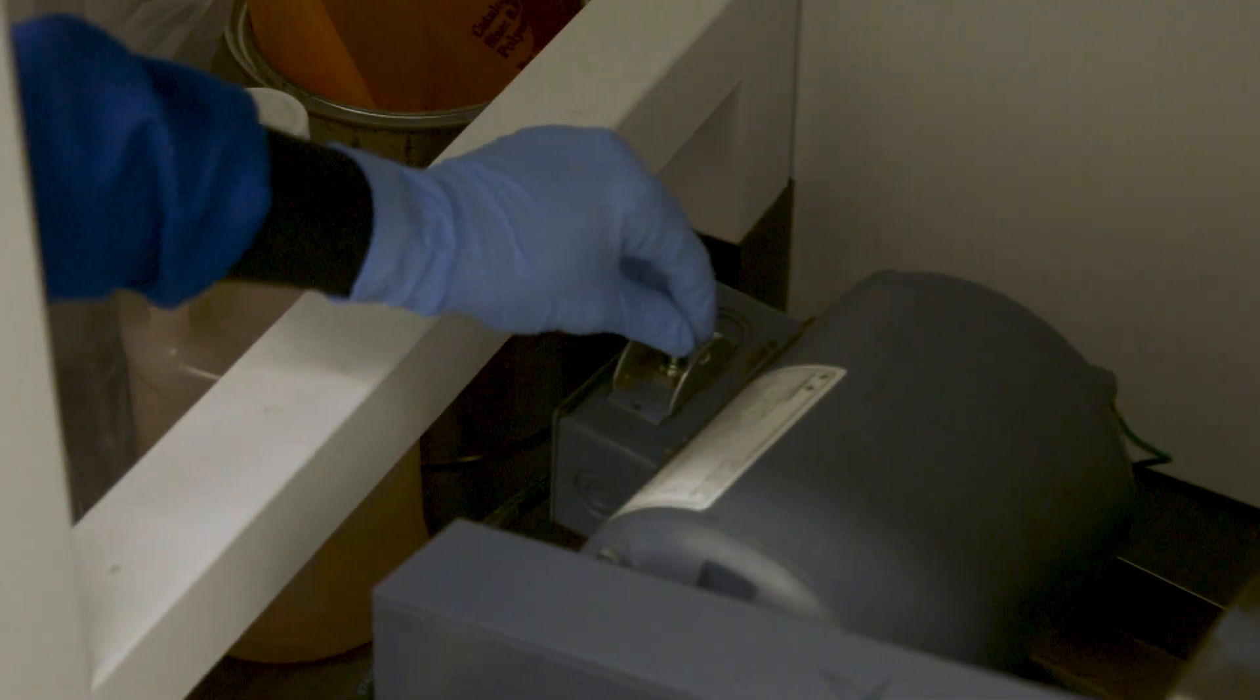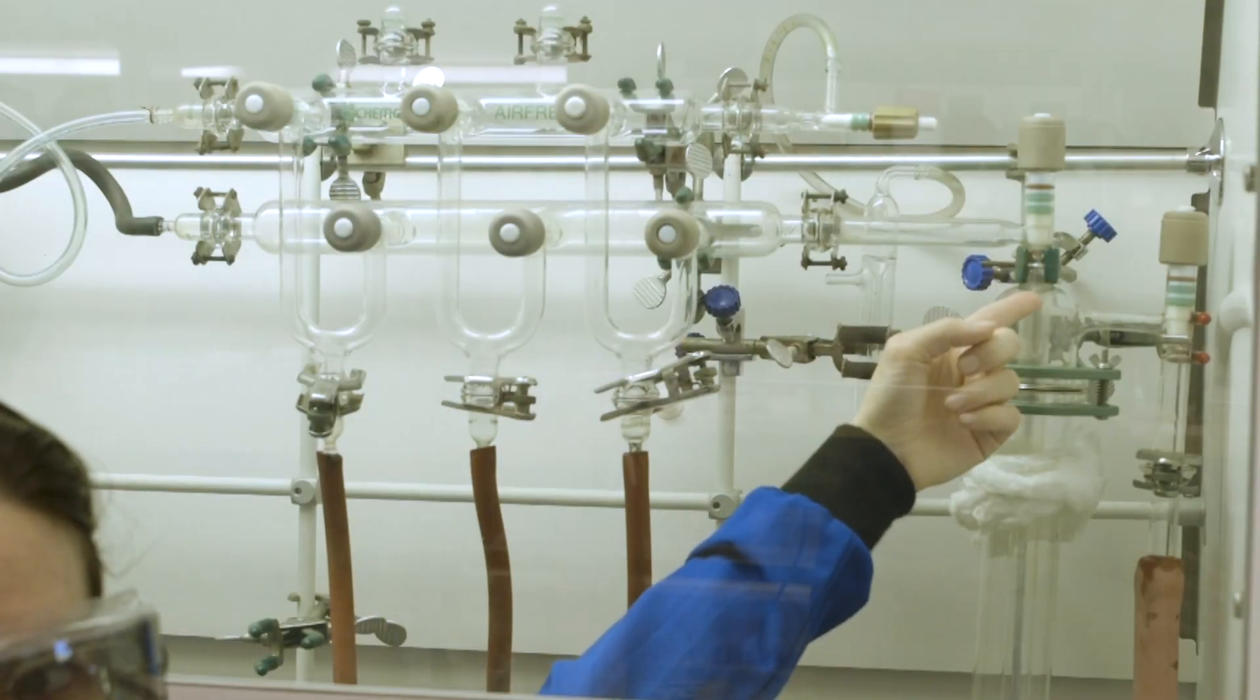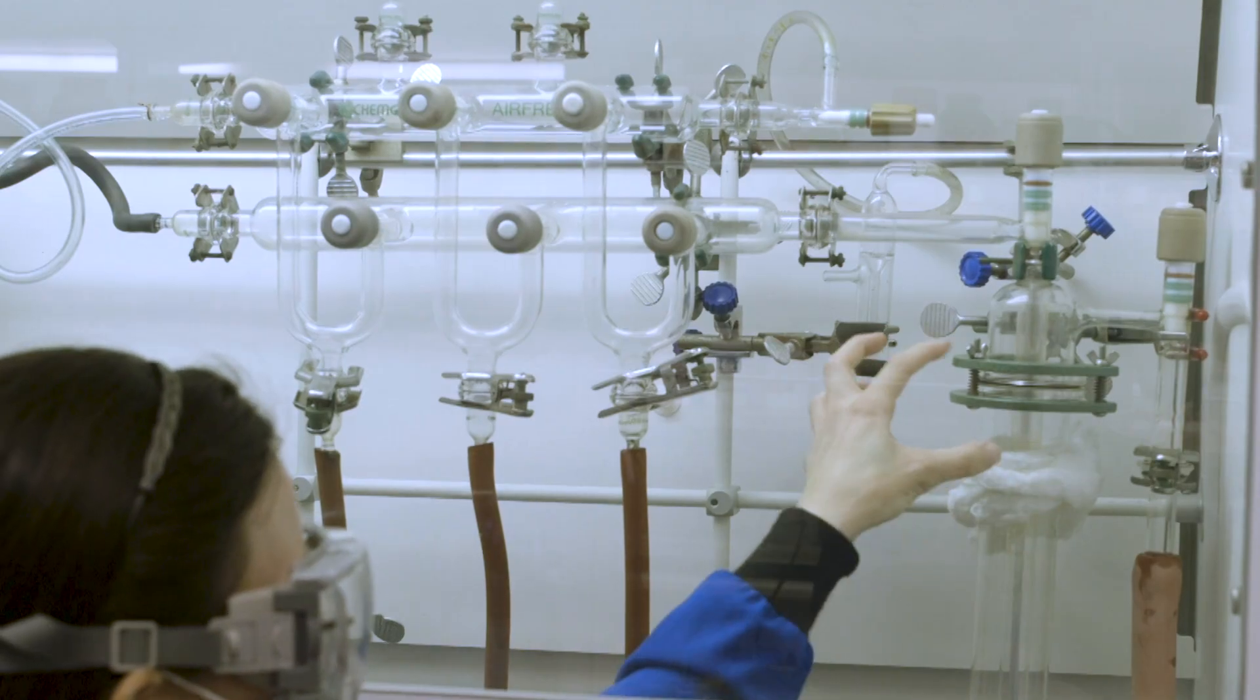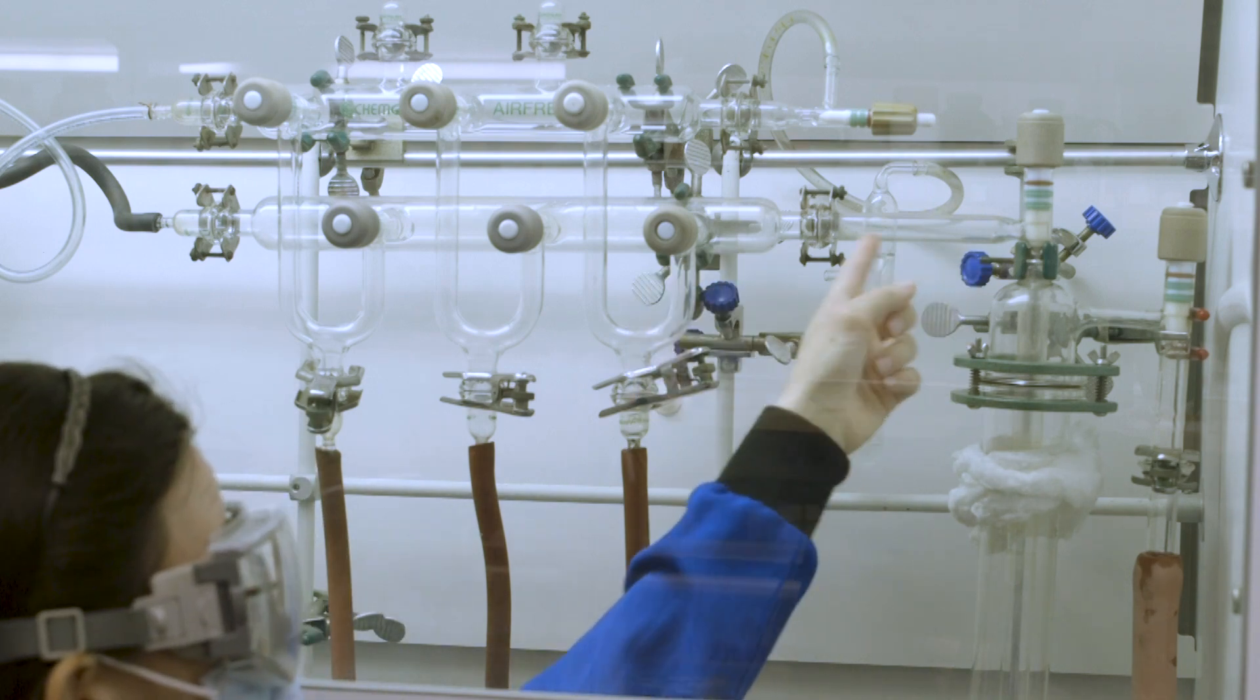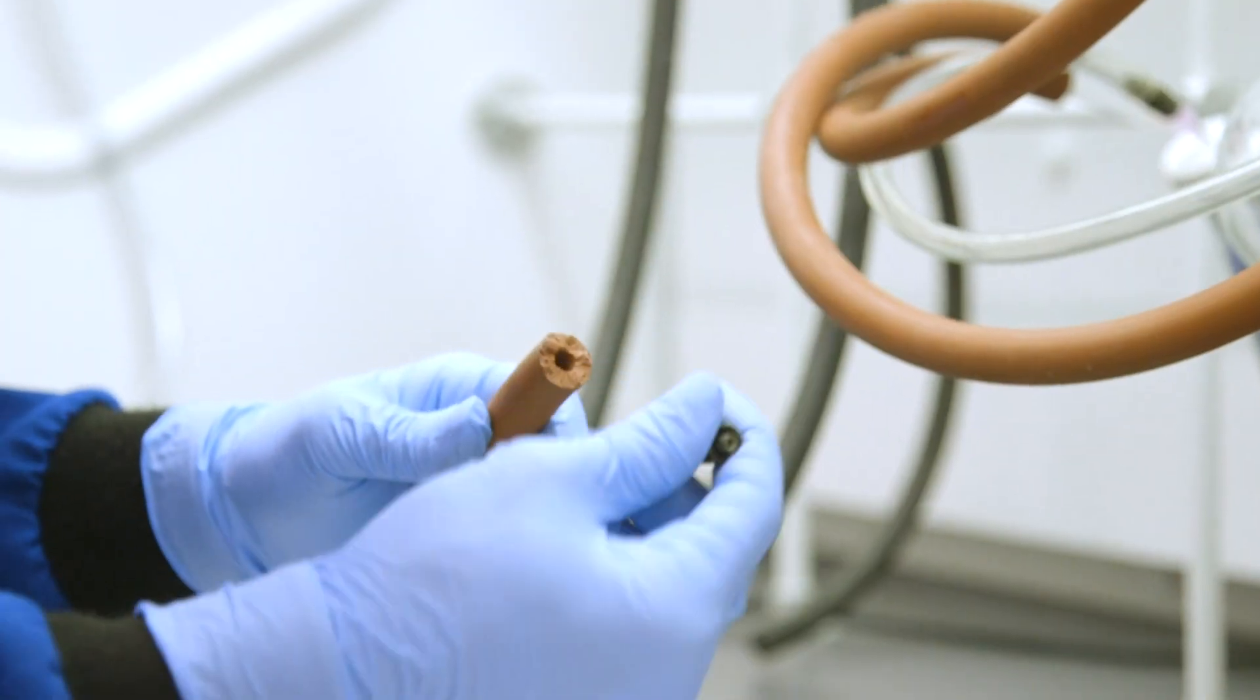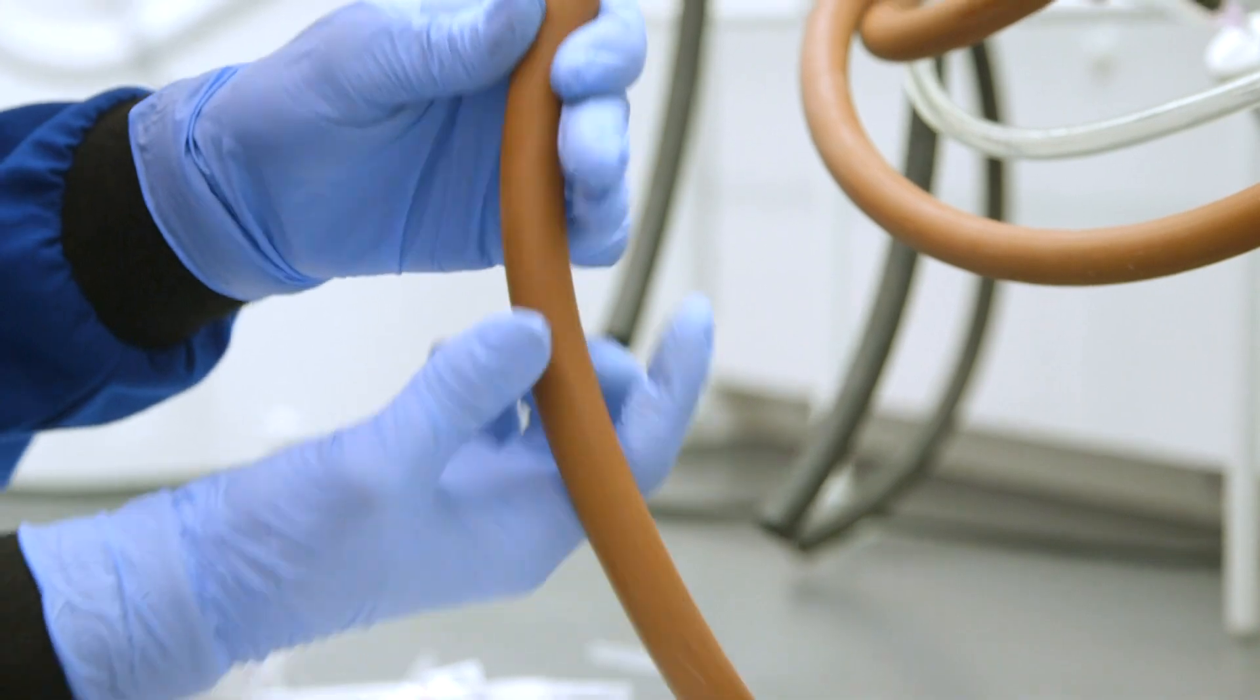A vacuum pump connected to the manifold provides the vacuum. A liquid nitrogen trap is used between the manifold and the pump to prevent contaminants from entering the pump or escaping into the atmosphere. The inert gas and vacuum can be supplied to the reagent bottle or reaction apparatus by a series of valves. These are connected to tubing that can be terminated with the appropriate needle or ground glass joint connections.